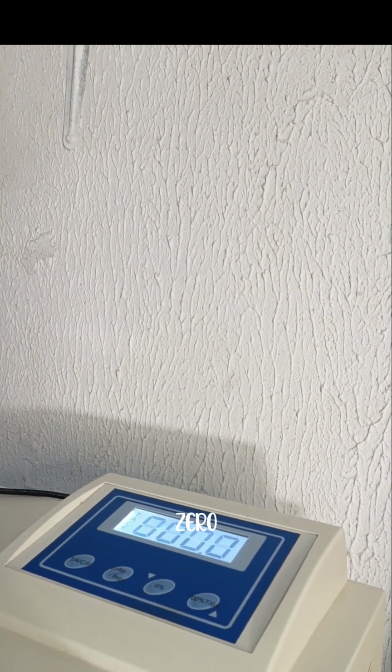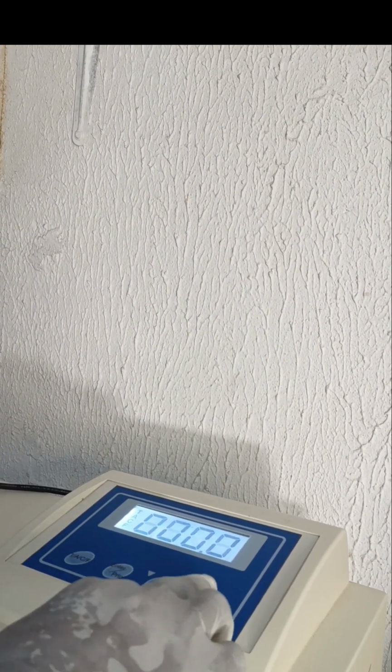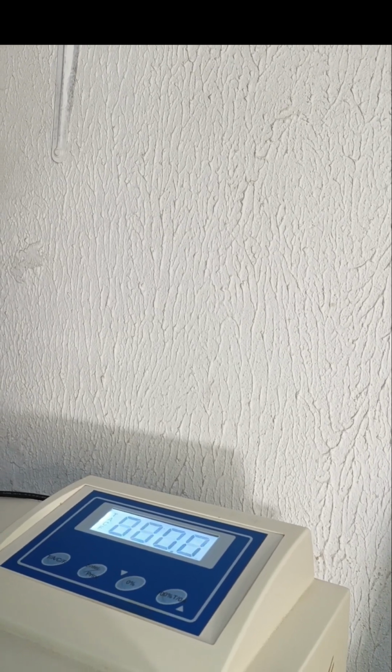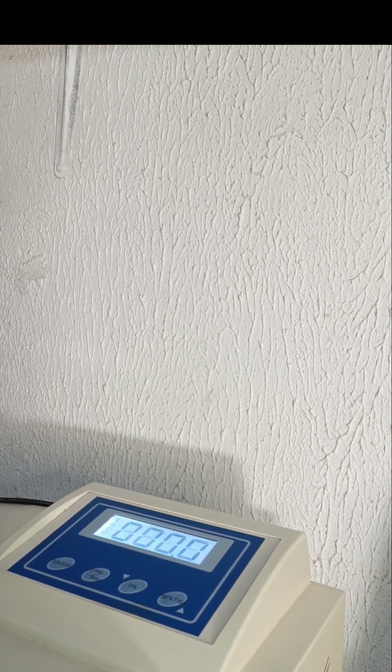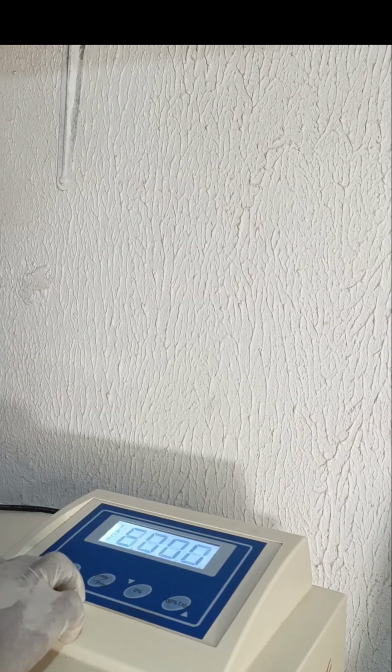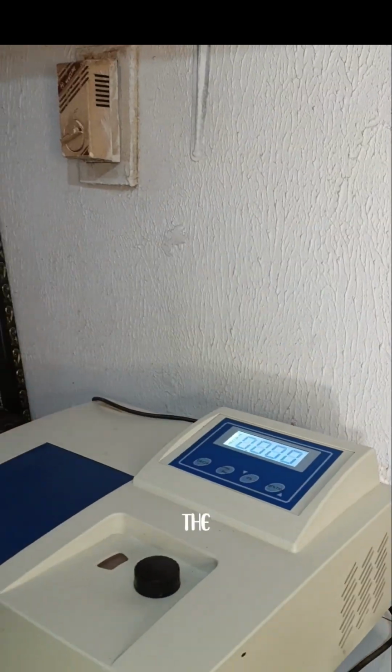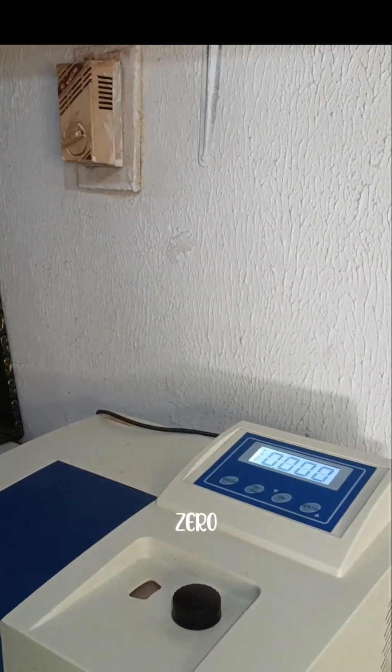Still zero the machine. As you can see, this is in absorbance. And we've brought the machine to zero.